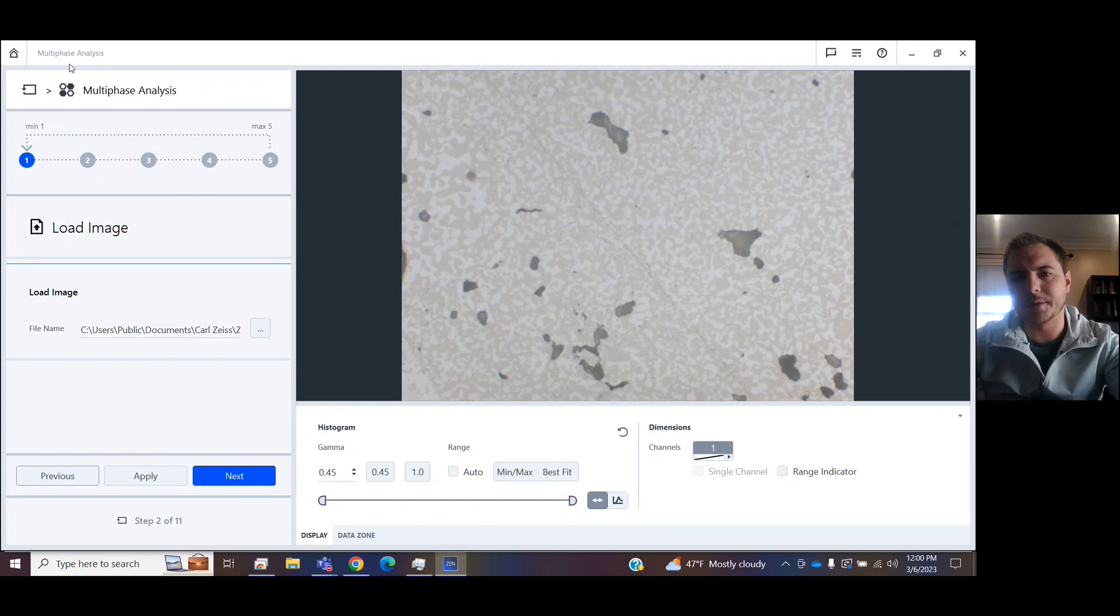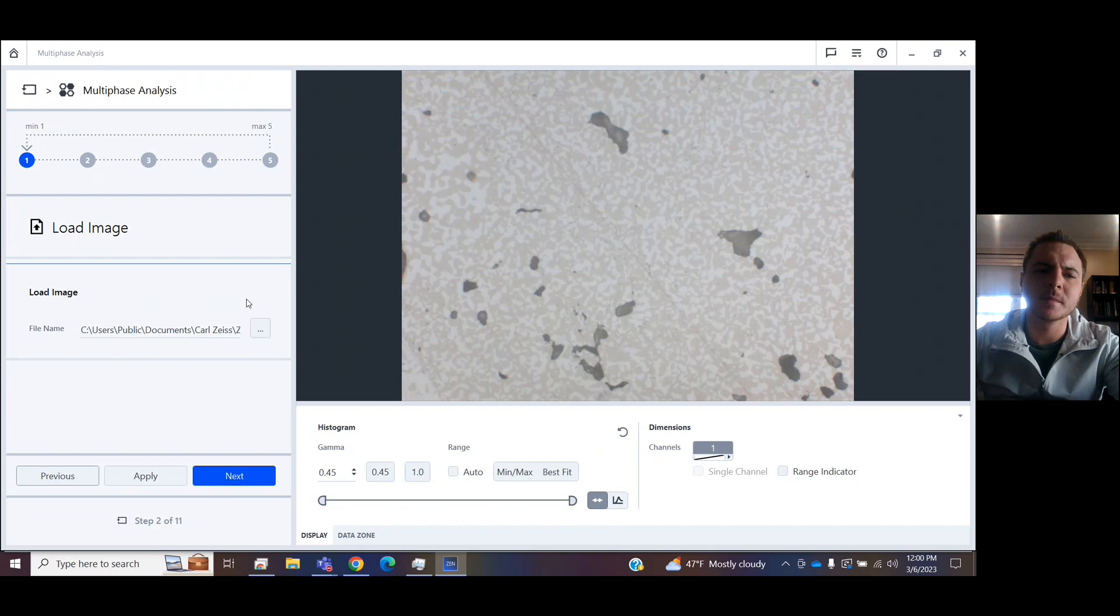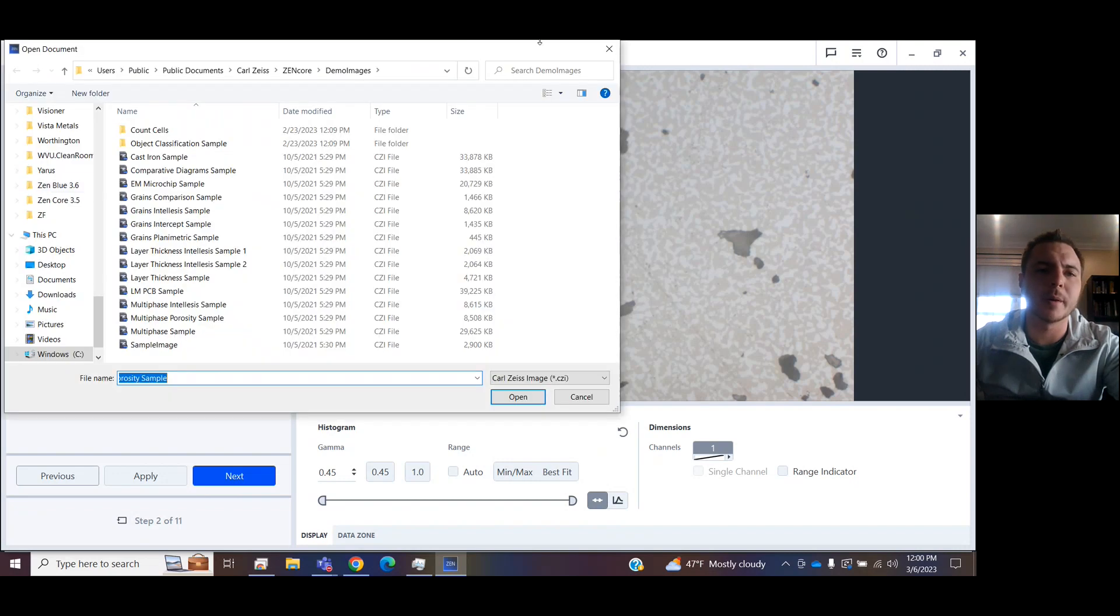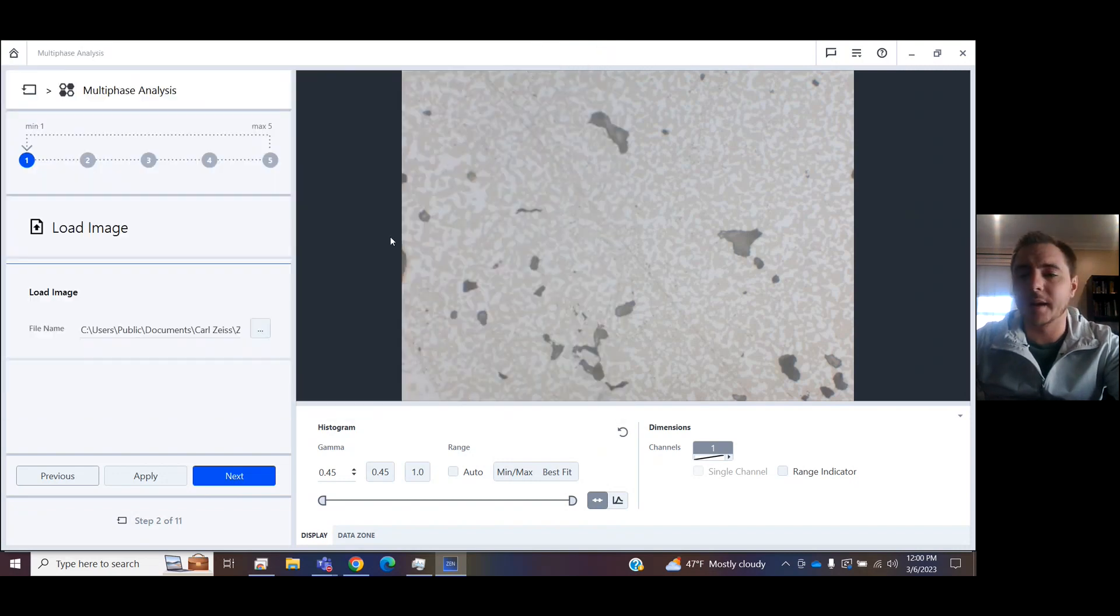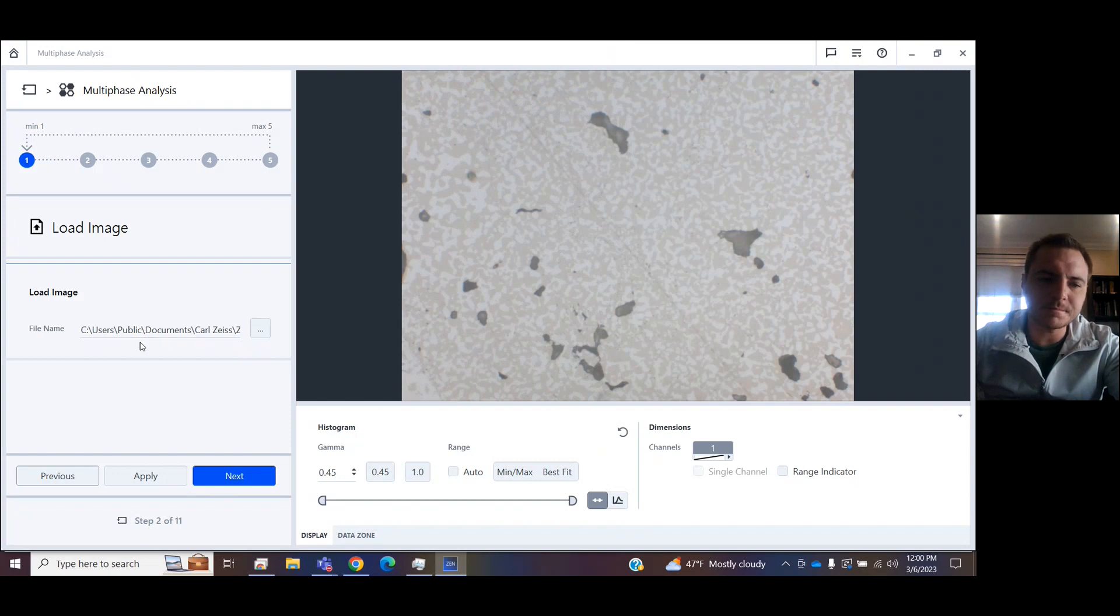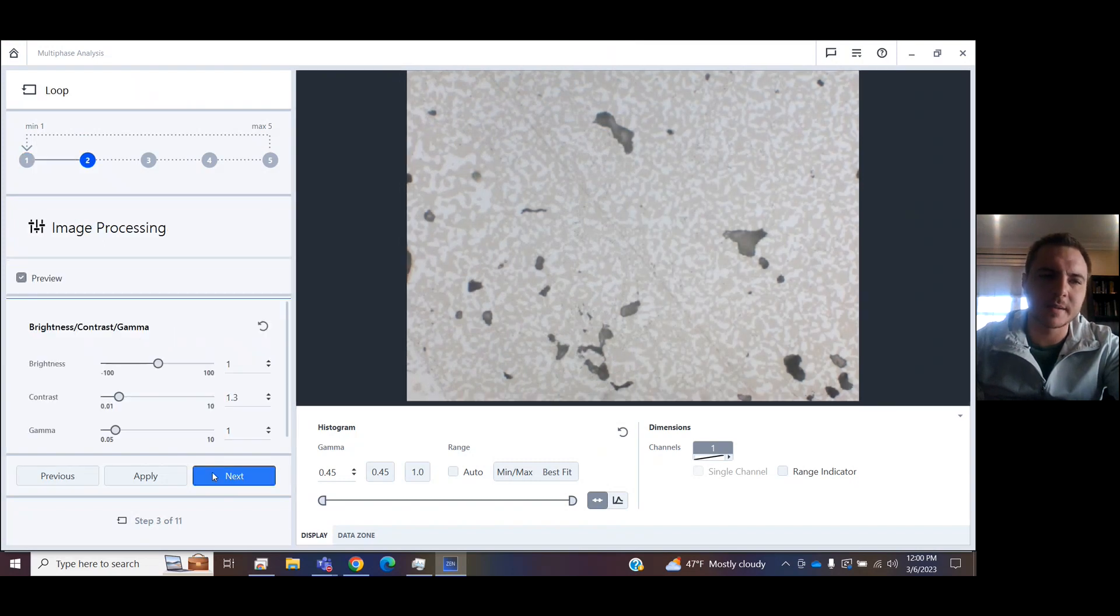So we have a picture right here, taken on a Zeiss microscope. You can choose any image anywhere that you've taken on this computer, and we'll press Next.